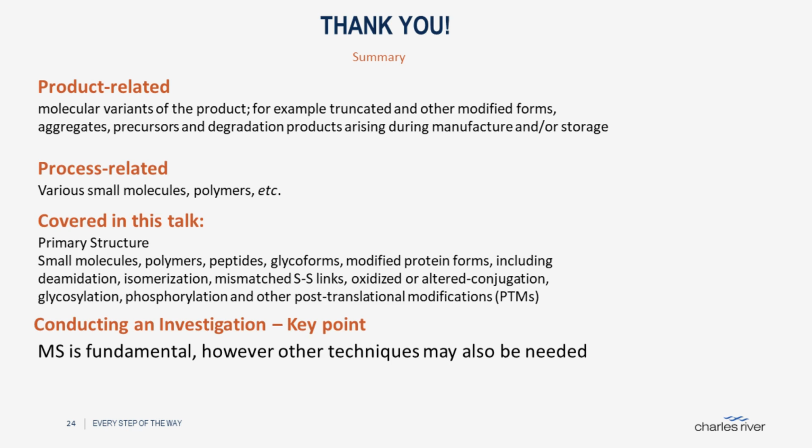Often the columns will be stored in about 80% organic, so we typically will use methanol. And then once a month, we will clean the systems fully, typically using isopropanol. But different procedures may need to be applied in different instances, so those are just general comments.